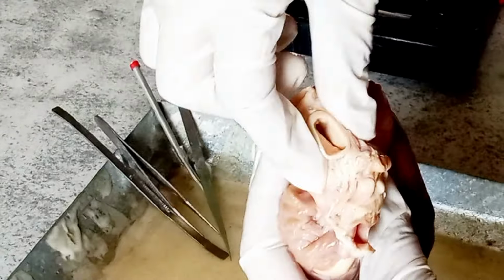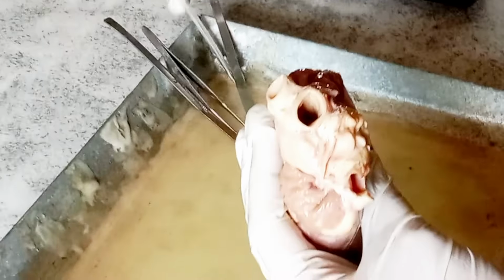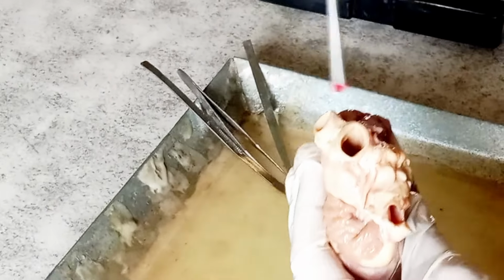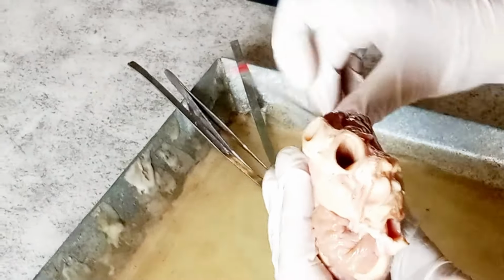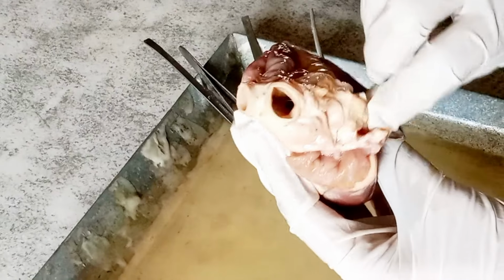Arteries are the blood vessels which carry blood from heart to all the body parts, and veins bring blood from all the body parts to the heart. You can find the difference between arteries and veins by the thickness of their walls. This is known as aorta. You can see here veins.